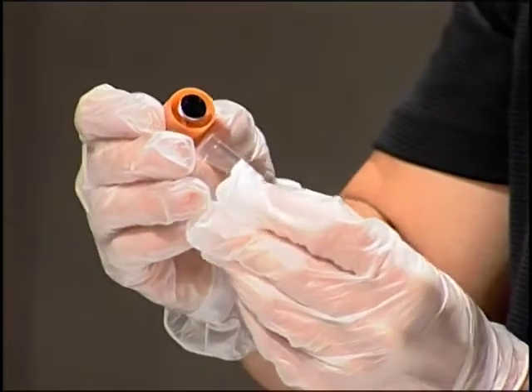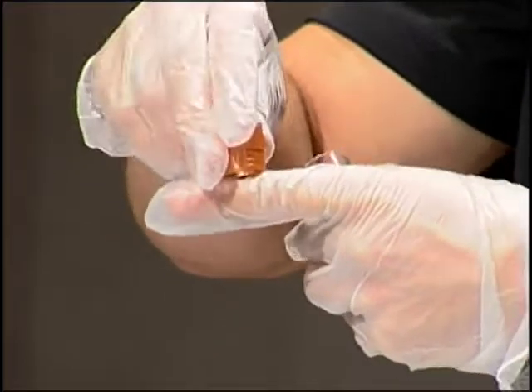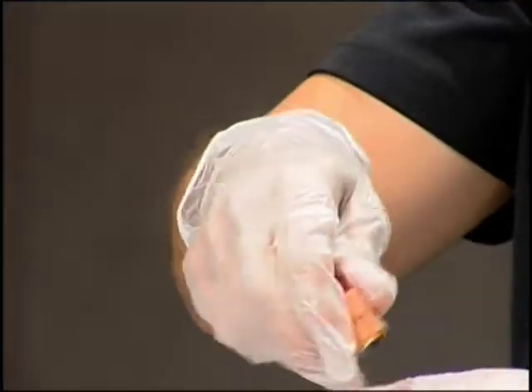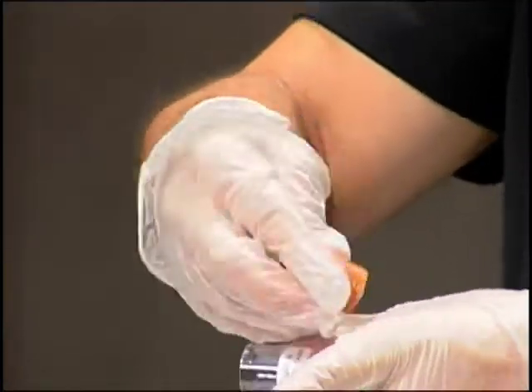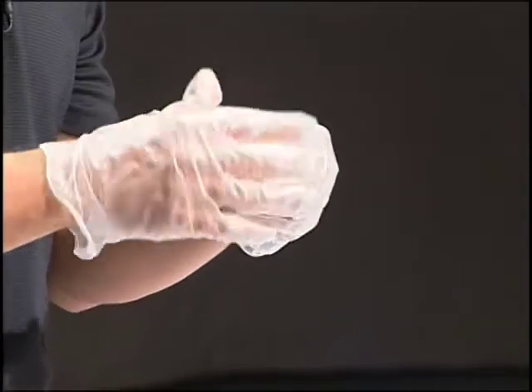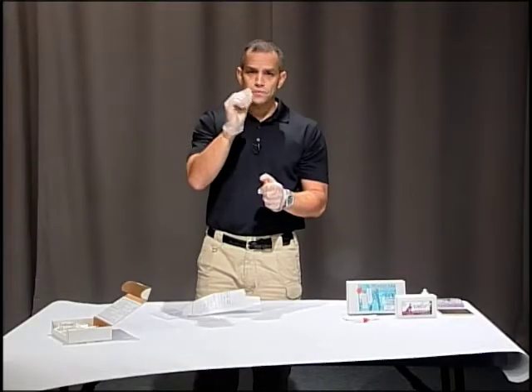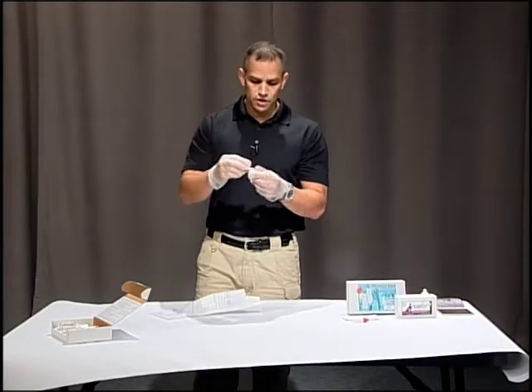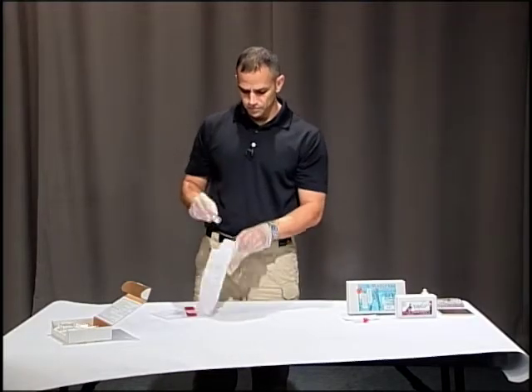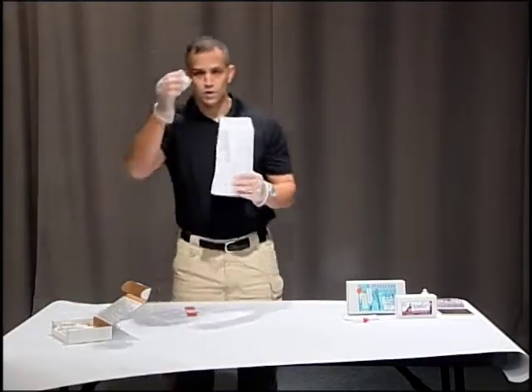This one says 'index finger and webbing, left hand,' so I would swab the index finger and the web of your hand. The way you're going to swab is to make a leopard pattern — you want to get all the areas, but you're not swiping, you're dabbing. Once you dab that area, put the cover back on, and it goes into your sample.